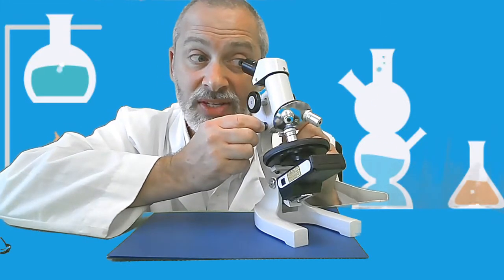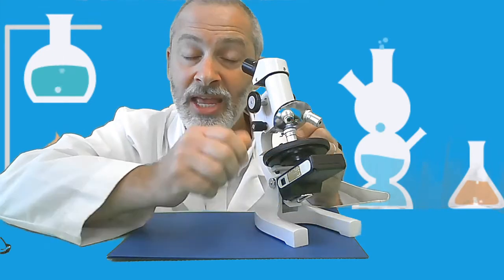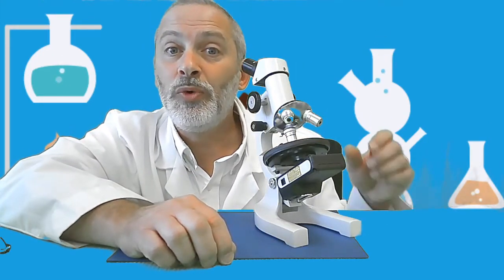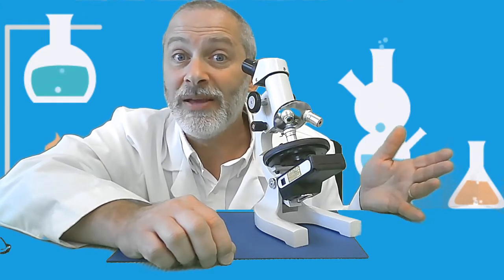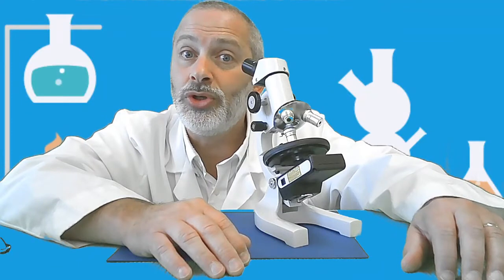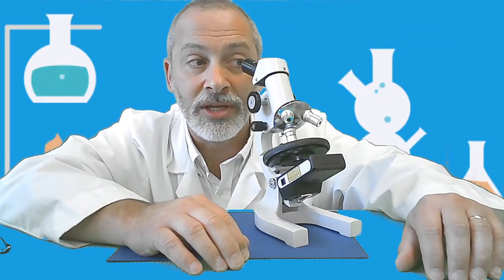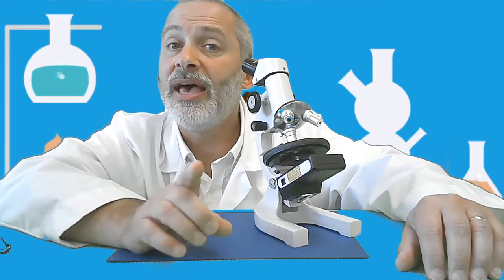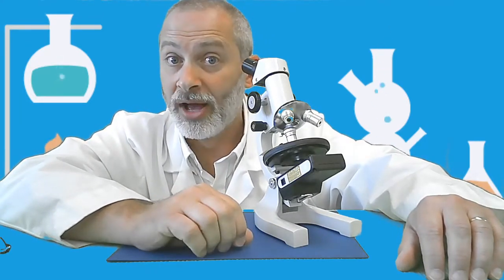And if necessary, use only the fine adjustment knob to focus. And that black needle will be pointing to whatever it is you wanted them to see. So use all of the tools available to you on the microscope to help you get your image into focus and to help you share what you're looking at with someone else.